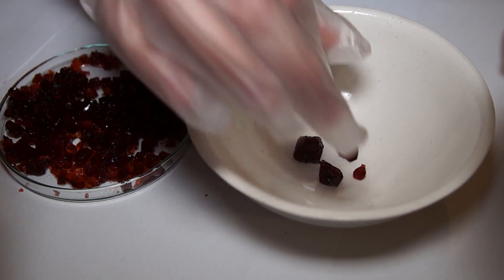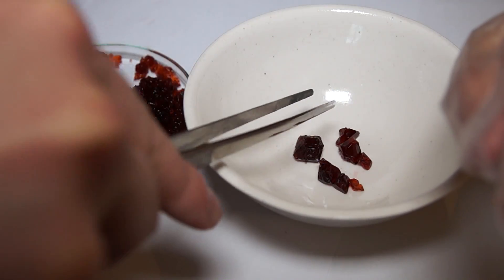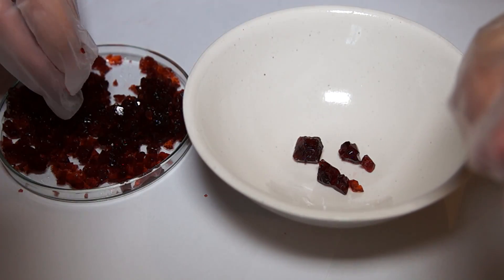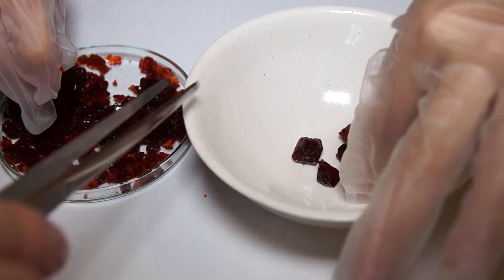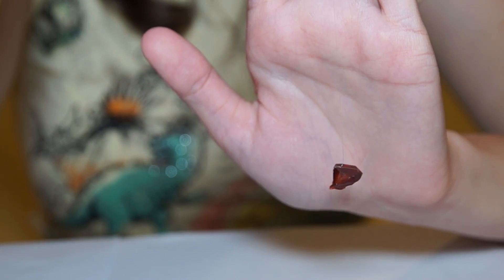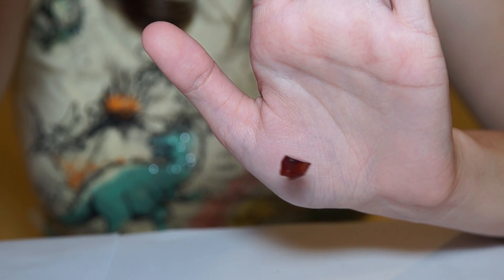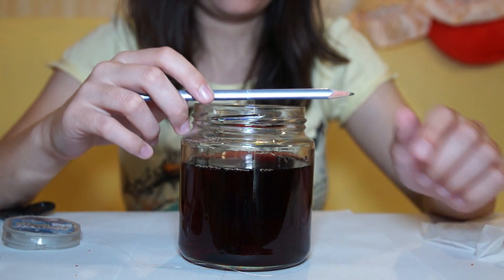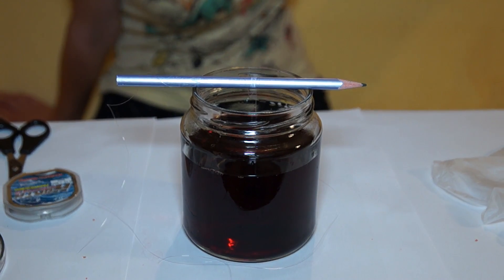I also advise you not to handle the cobalt ammonium sulfate with your bare hands — it's better to use gloves. This crystal will serve as a seed. The selected crystal should be tied to a fishing line and hung in a glass or jar into which you have poured the salt solution.